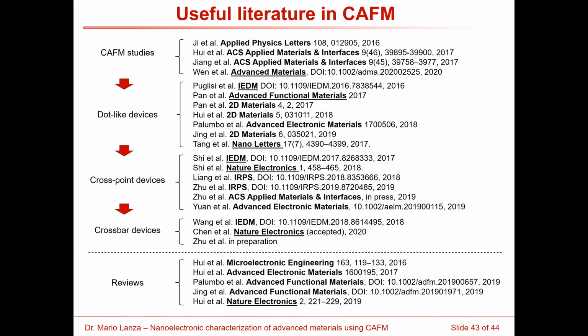I think the main conclusion of my work is that the conductive CAFM is a very powerful tool to analyze the electrical and the mechanical properties of different materials at the nanoscale. Actually, it has a unique performance and it can be very useful for many different research directions. Traditionally, it has been used to analyze the reliability of ultra-thin oxides, but as you have seen in this presentation, it can be applied to measure resistive switching, to make three-dimensional scans. It can be combined with ionic liquid, with SEM, with TEM. So it is something very attractive.